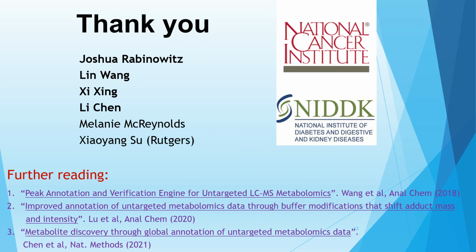Most of the information I presented today is covered in two recent papers in Analytical Chemistry. We do have another paper coming out soon, which provides a general tool to annotate untargeted LC-HRMS data, and I hope you can give it a try.